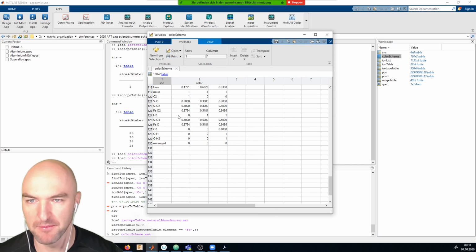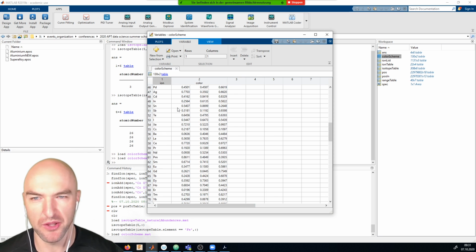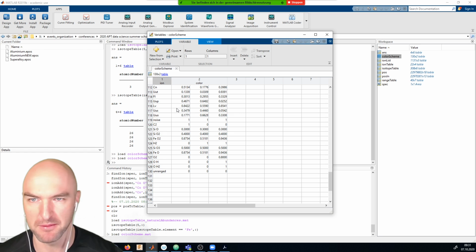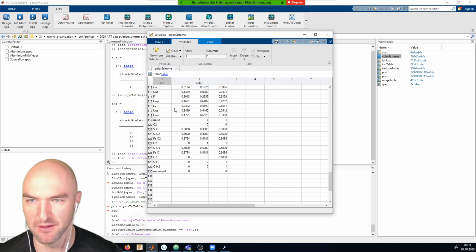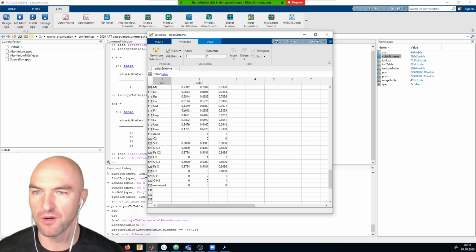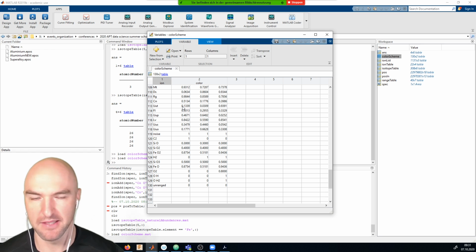Good. And so here for the coloring, we don't usually use charge states and we don't usually use isotopes. But I think there's not anything that really would keep you from doing that. But for now, we've done the coloring just based on the ion itself or the element. You usually get the ability to work either with the ions as ions or with the ions decomposed in the individual atoms.